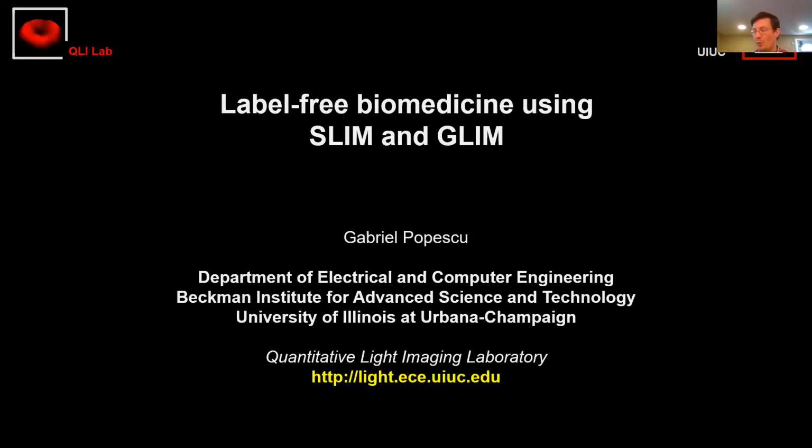You're getting the ensemble behavior of a whole bunch of these droplets when in some cases, really what researchers want is to know how things behave at a very small, nanometer scale or micron scale level. And I see these techniques being almost uniquely able to provide that kind of information. Have you done any research in that area recently? I know you have in the past.